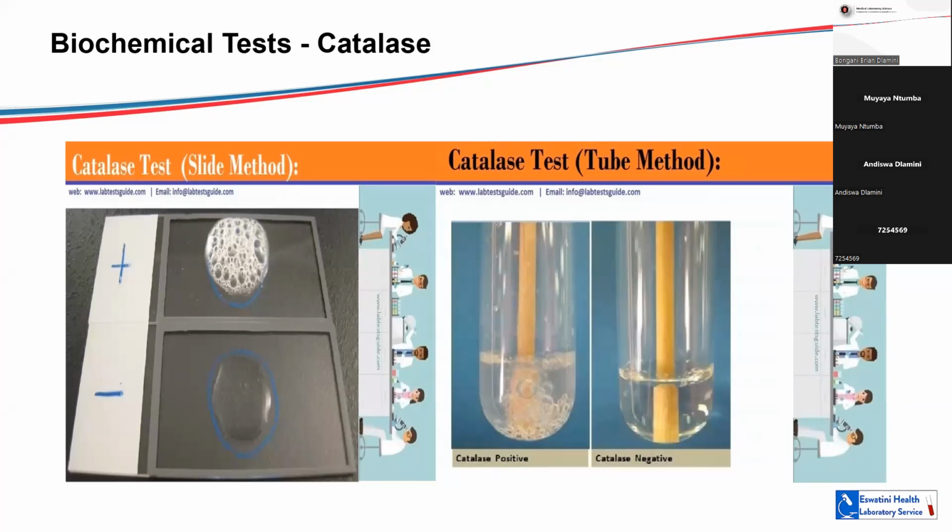as you can see on your, is it on the left? Yes, on the left on the slide, the positive reaction, you can see the bubbles on the slide, as well as on your right, there are some bubbles in that tube.